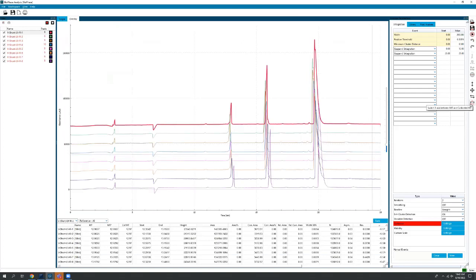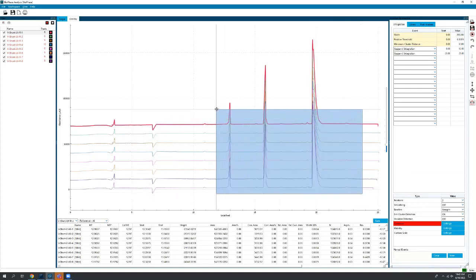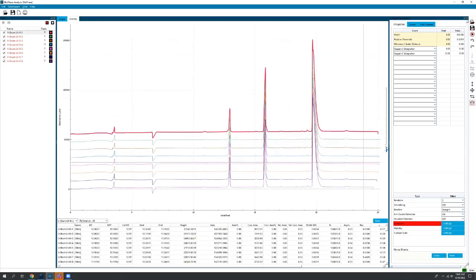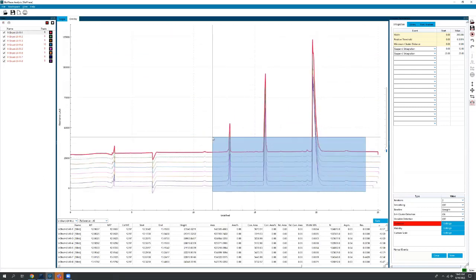Now over here, because we do have a 10 kilodalton marker, we can switch between raw migration time and this calibrated migration time. So you can use relative migration time with this software. It's very easy to use, a very, very handy tool. If you're running CIEF, you calibrate your PI markers. On SCIEX, you can calibrate it by an internal standard if you so choose. You can change the zoom there with that setting.